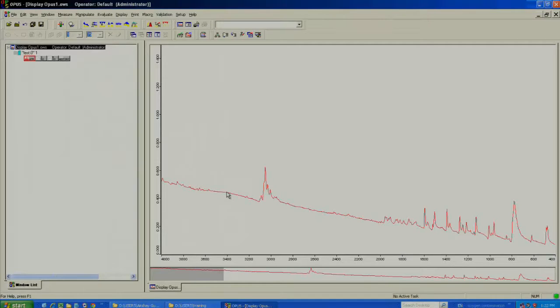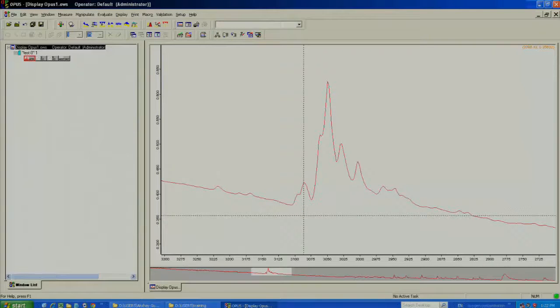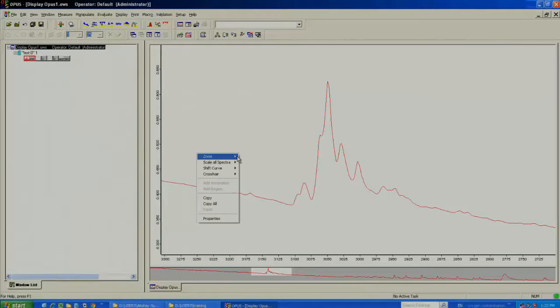Now you can see a signal. You can zoom in on it by right-clicking, then click Zoom, and then click Zoom In. You click and make a little box, and then click where you want the box to zoom in. If you want to completely zoom out, right-click, click Scale All Spectra, and then click Show Everything.